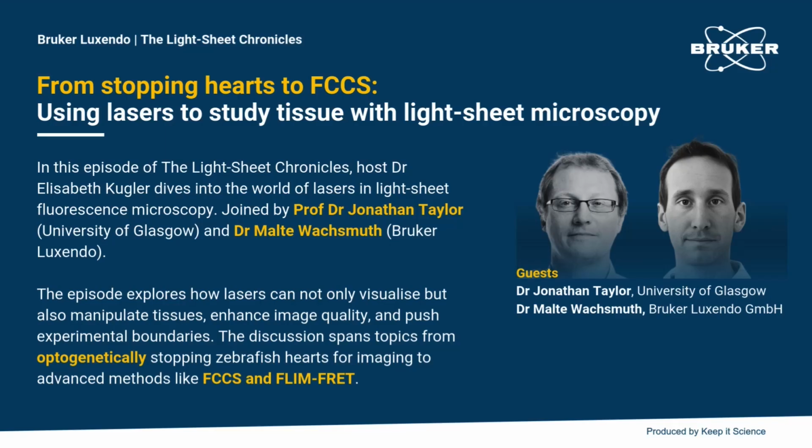Yes, so these tension sensors are fantastic. This is really building on this concept of proximity influence between different fluorophores. Martin Schwartz's lab have developed these wonderfully physical tension sensors where they've basically taken a molecular linker protein, but they've embedded into it two different fluorophores that are separated by a short length of elastic spider silk peptide. So this has basically made two fluorophores attached by a really tiny molecular spring.